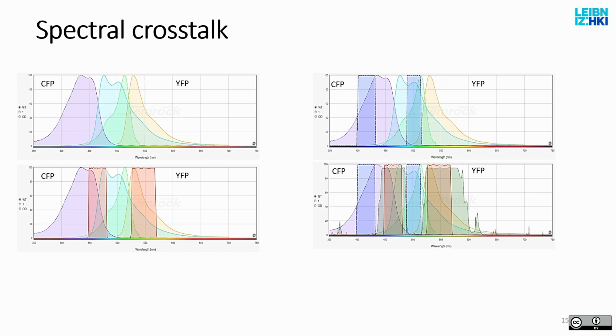And on laser scanning confocal microscopes, on some microscopes, I have the complete freedom to set up the emission wavelength range from which I detect.